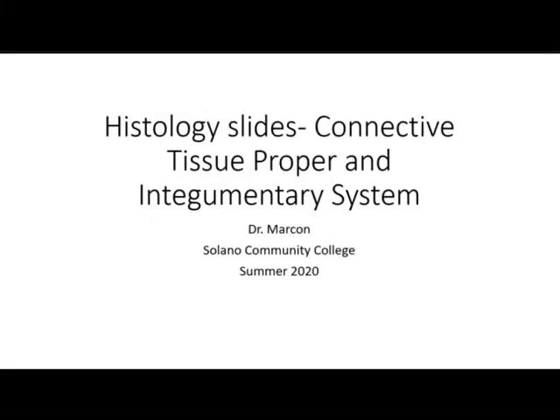Hey everyone, this is Dr. Marcon, and this is a video going over the histology slides that I either posted on Canvas or have emailed to you. So first we're going to go over the slides for connective tissue proper and the integumentary system.